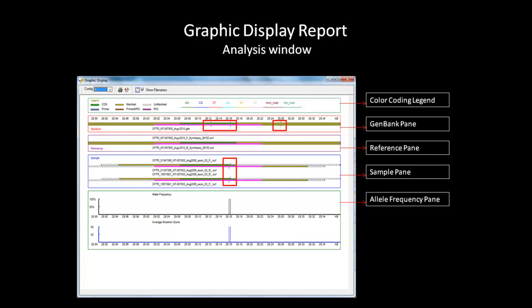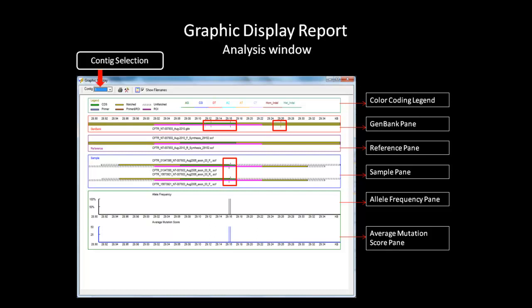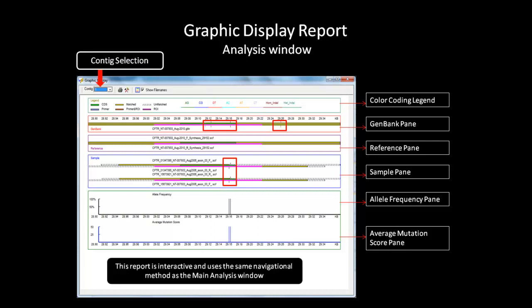The allele frequency pane shows the percentage of samples in the contact with mutation at the indicated position. The average mutation score pane shows the average mutation score for all the calls at that position. The allele frequency and mutation score pane should have peaks at positions that correlate with the tick marks in the sample pane. You can choose which contact is displayed by using the drop-down menu in the toolbar. The entire report is interactive and navigation uses the same method as the main analysis window. This report can be printed by using the print icon on the toolbar.